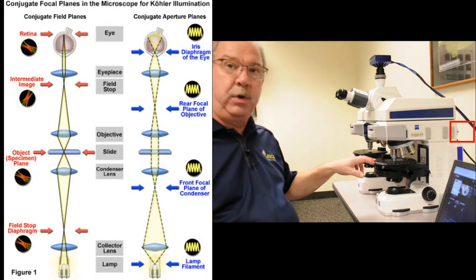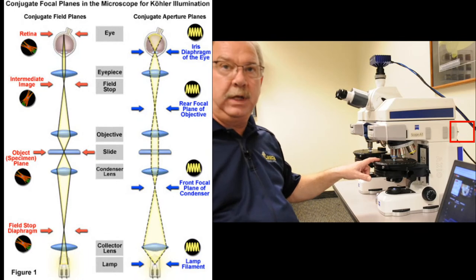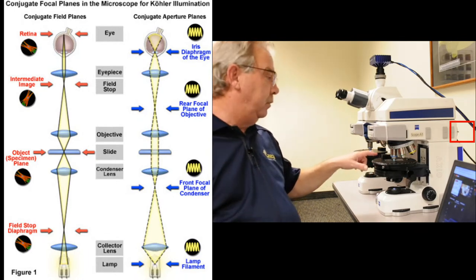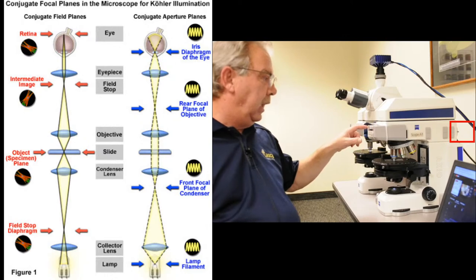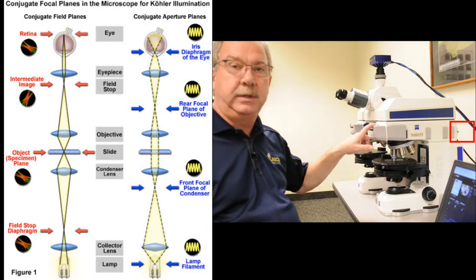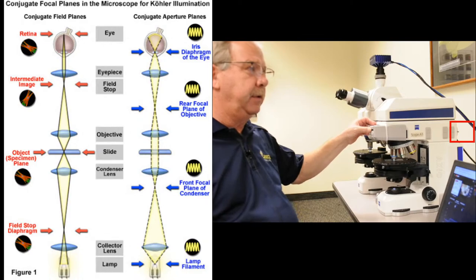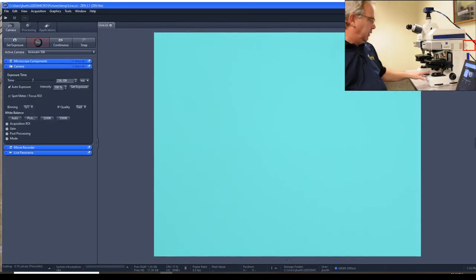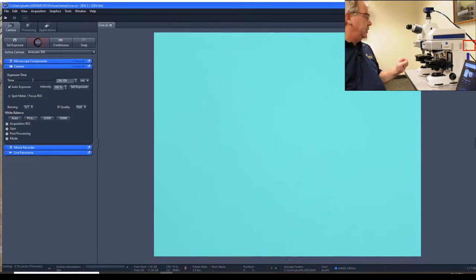Kohler illumination, cross polars — and as with any high dry magnification, we want the top lens of the condenser inserted. Then we bring the Bertrand lens in. Now I'm switched to a live camera. I've got this large olivine crystal in focus underneath my 40x objective — a pole objective with a 40×0.90 numerical aperture — and we're in cross polars. I'm going to insert the Bertrand lens now.